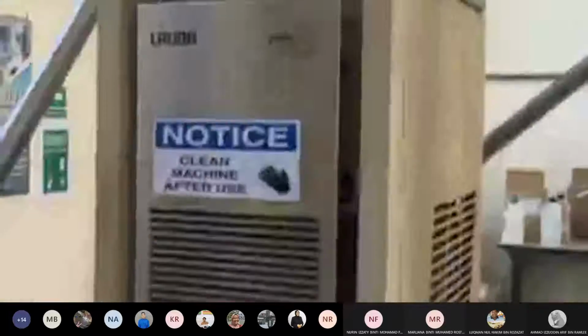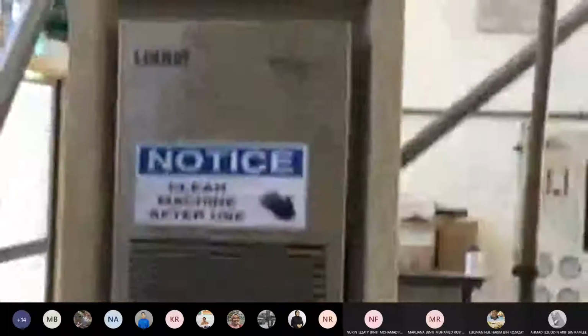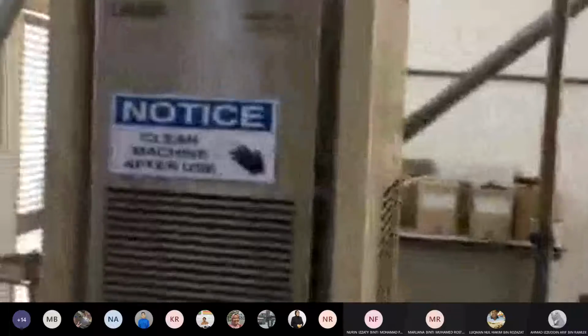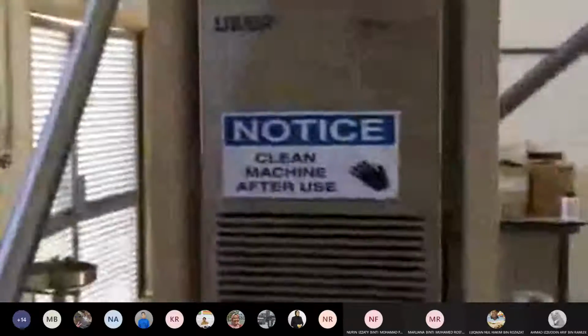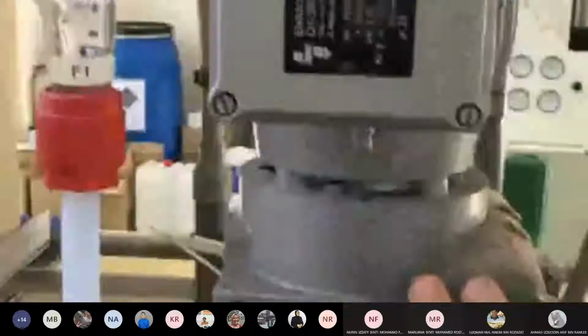Okay, alright. Another thing that I forgot to say: in experiment 1B you will compare different temperatures. So we will heat up our reactor. In this reactor configuration, we use a water bath. Usually in industry they don't use a water bath, but this is a 10 liter reactor, so they just use this water bath. This water bath will heat up the water and then it will flow into your reactor. You can see this is the stirrer motor.